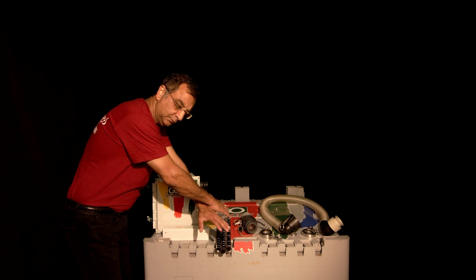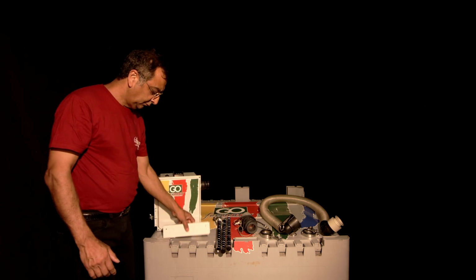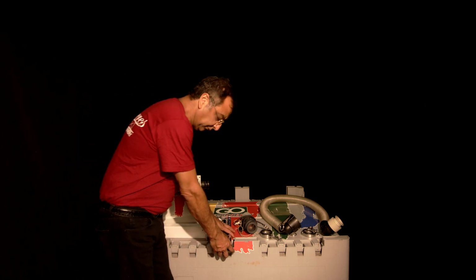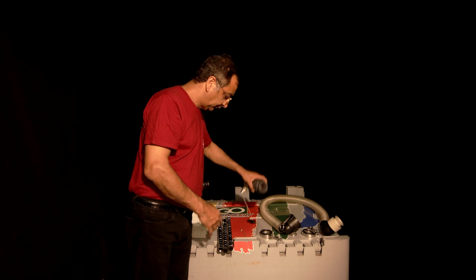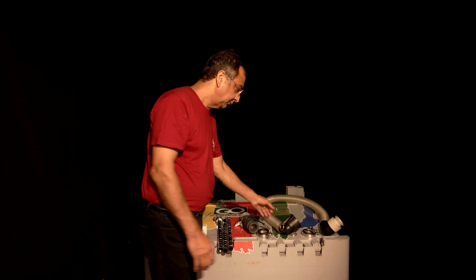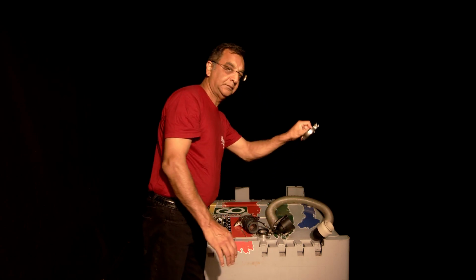First of all, you'll have a base that's folded up. That's your controller. There's a little bracket that attaches to it. That's the support pole. You'll find a vent valve that comes with a tri-clamp. There's a hose for inflating the bag and also a tri-clamp to attach it.